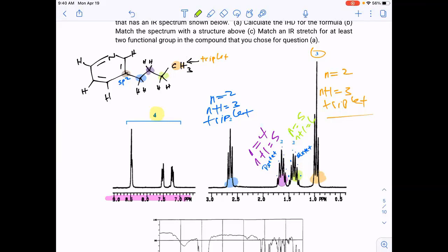All right, and you can see in the aromatics, how many signals would you expect for the aromatics? 3. I would say 4. Expected. 4. Oh, expect. Sorry. No, it's okay. You got 4 protons, right? So I would expect that to be 4 signals, but 2 of those protons must be equivalent because you only have 3 signals. Are you following me? Yes. Yeah, so 2 of them have to be equivalent.